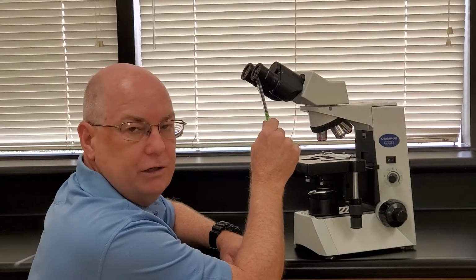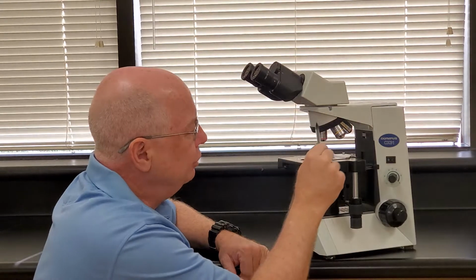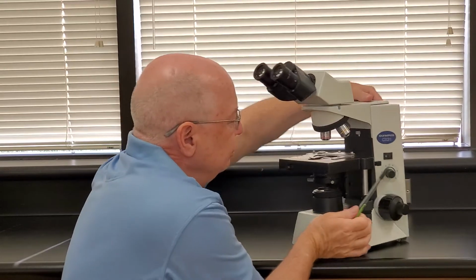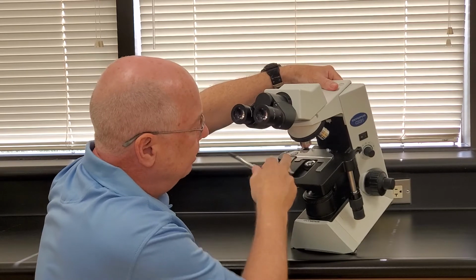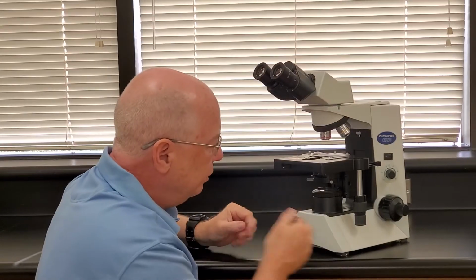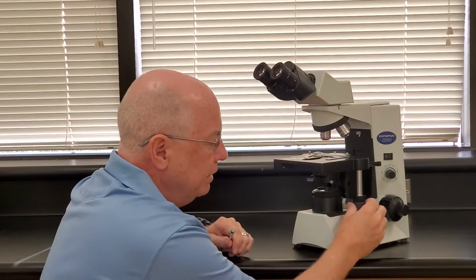You need to know the ocular or eyepiece. You need to know the revolving nose piece. You need to know the objectives. You need to know the stage or mechanical stage. You need to know the stage clip, the metal part, and you need to know the condenser. You can either point to it underneath here or the lens on top. And then you need to know the light source or lamp, and you need to know the stage control knobs.